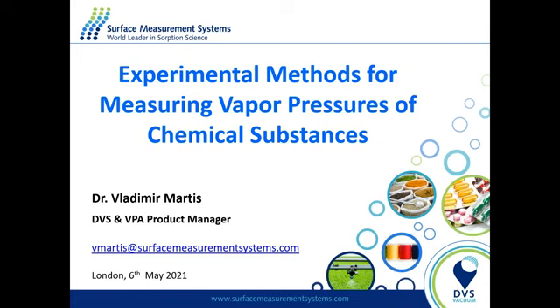Thank you very much for dialing in today and joining this afternoon's webinar about exploring the experimental methods for vapor pressure measurements. First, I'm going to give a short introduction to vapor pressures. It's just one slide, which is quite busy.